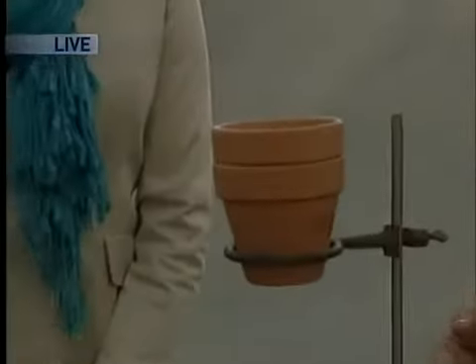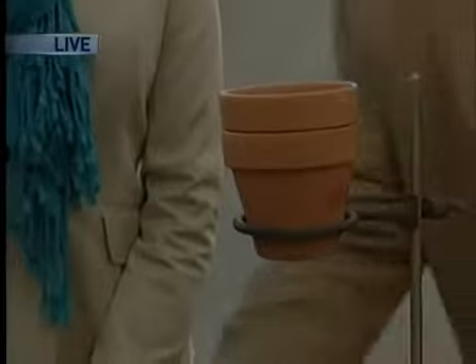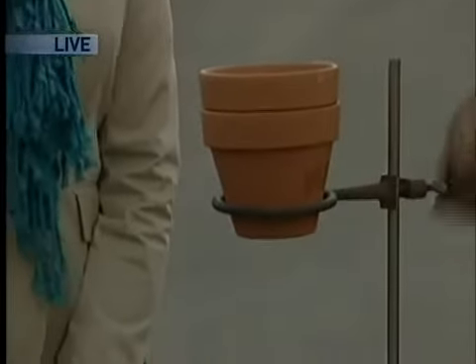You're making a volcano. I'm sort of making a volcano, in a way. What's the catalyst? Well, this isn't really a catalyst. This is glycerin. It's pretty thick stuff, and now that it's been sitting out here for a while, it's pretty cold. I'm using this to set it off. I have a little bit of potassium permanganate, and glycerin and potassium permanganate react exothermically, and that's going to trigger the thermite reaction. They used to use thermite to weld railroad rails together back in the 30s, 40s, and things like that. So it gives off a lot of energy.